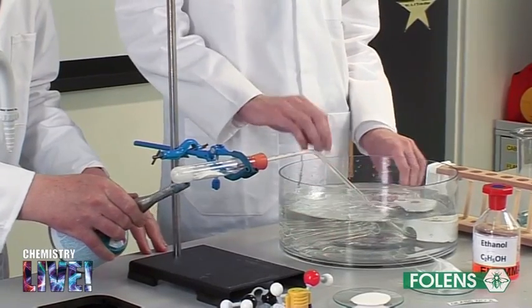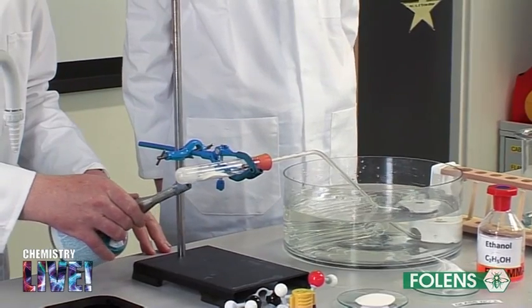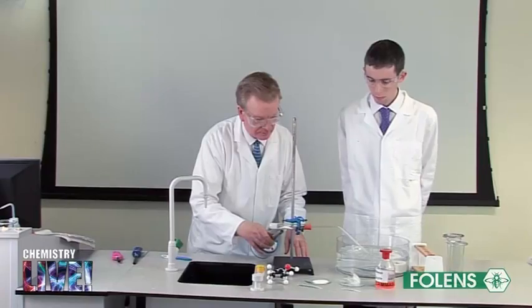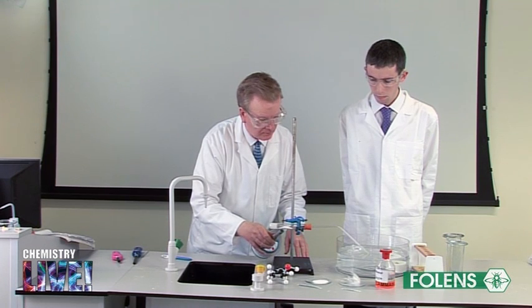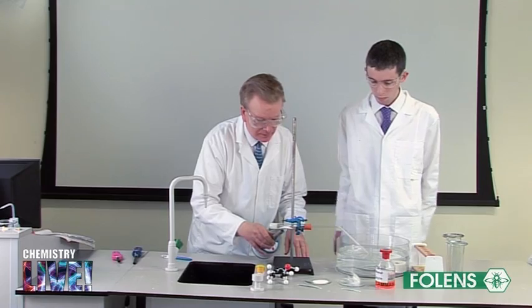If the ethene is bubbling off too slowly, move the Bunsen burner near the ethanol for a brief moment. Allow the bubbles to escape for a short while as these are mainly bubbles of air displaced from the apparatus.